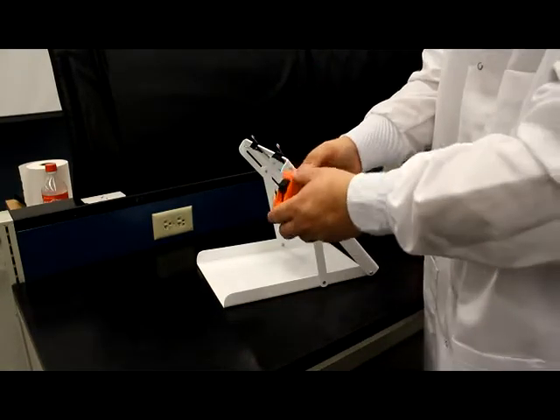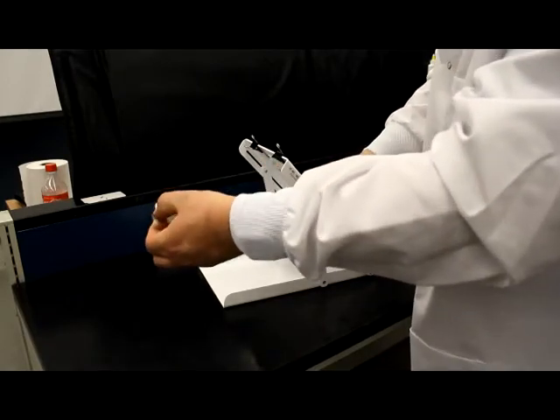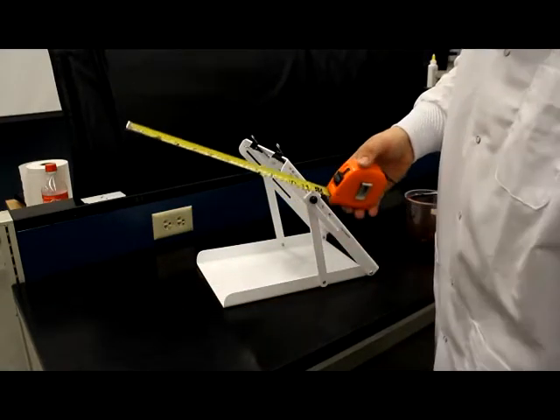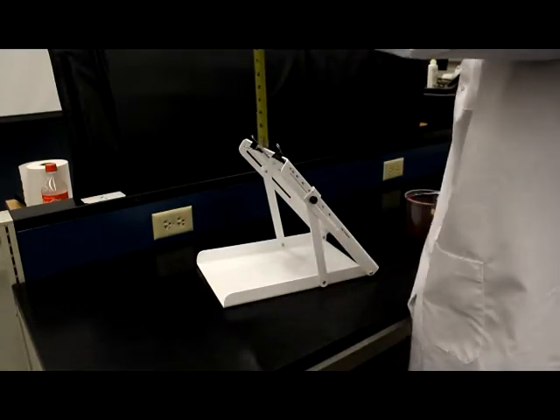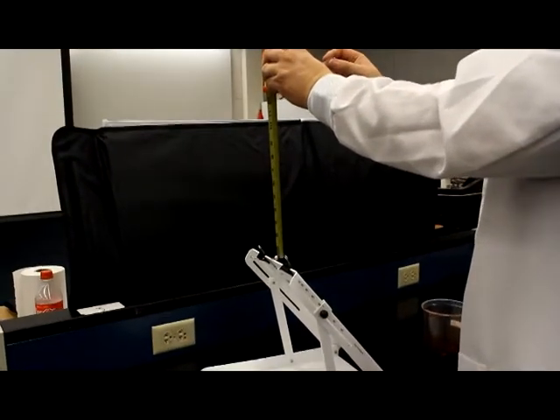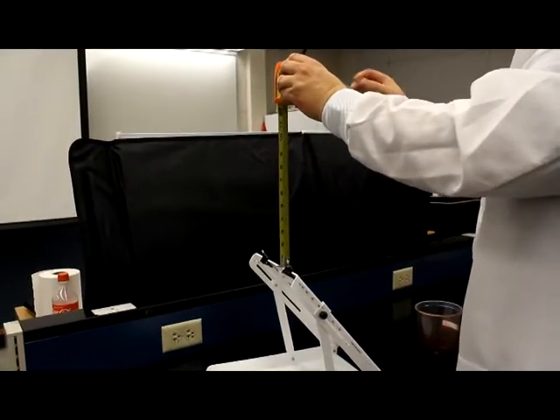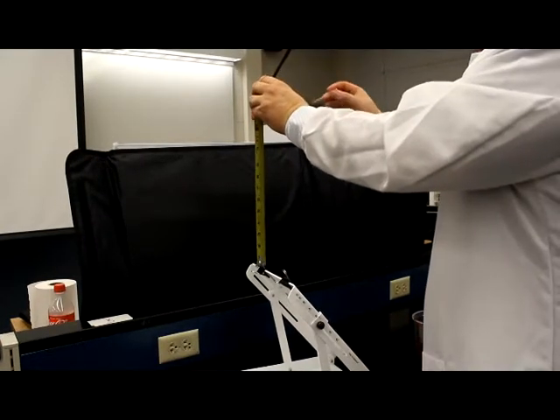The other tool you're going to want to use today is your tape measure. Your tape measure is really important, and you're going to want to set it at approximately just past 1 foot. And by pushing down this, you'll hold it in place. This allows you to basically set a height, and from this, you can take your pipette and drop your drop of blood. Always drop your drops of blood 1 foot off of your card.